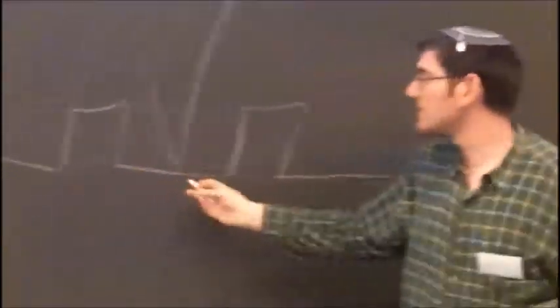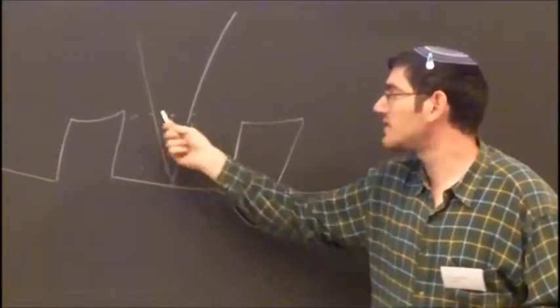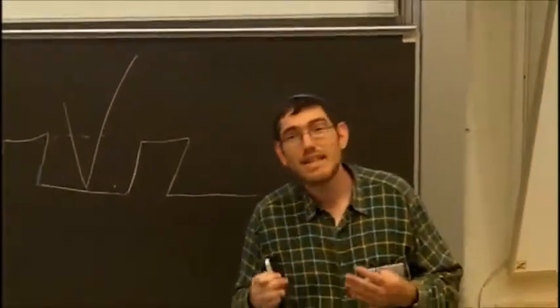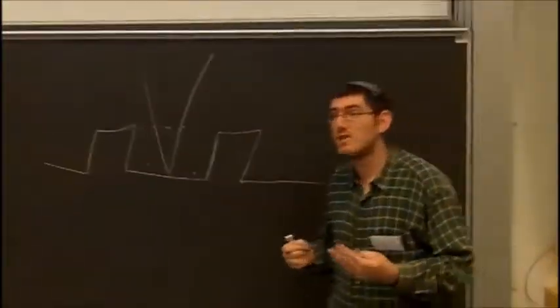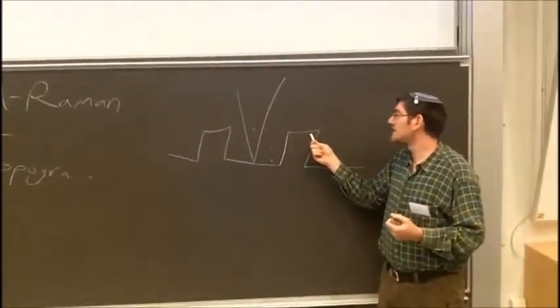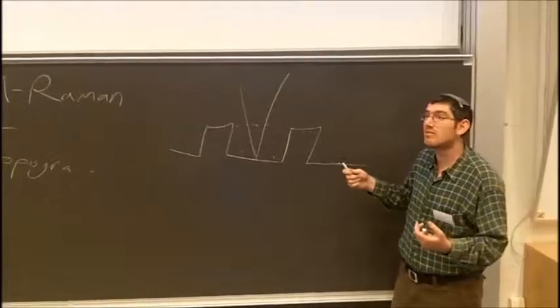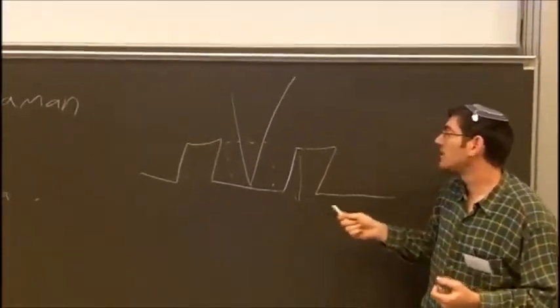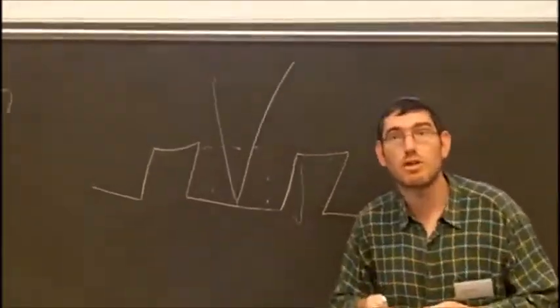So our focus will be lower than the surface. So the spectrum which we'll get can be a little bit different, especially if we're looking at surface analysis. If, for example, we have 70 nanometers of strained silicon here and the rest is silicon, it does make a difference where we're focused on.